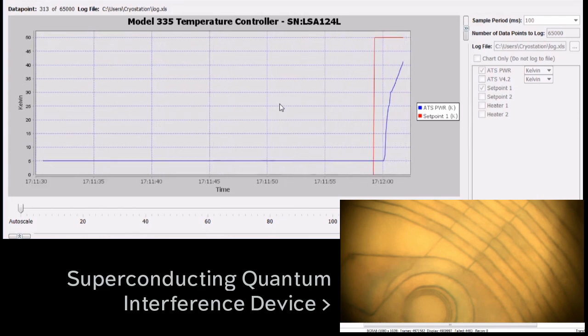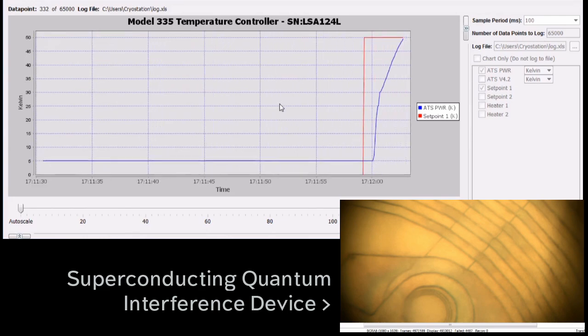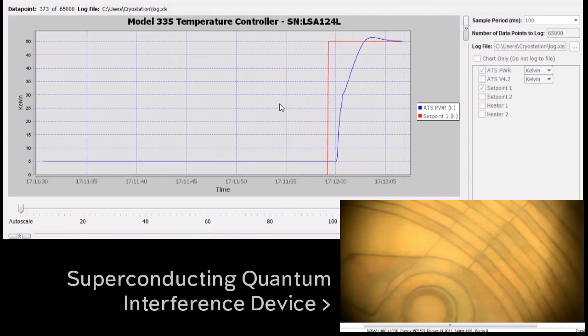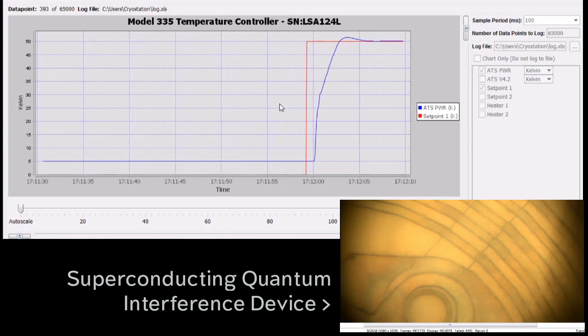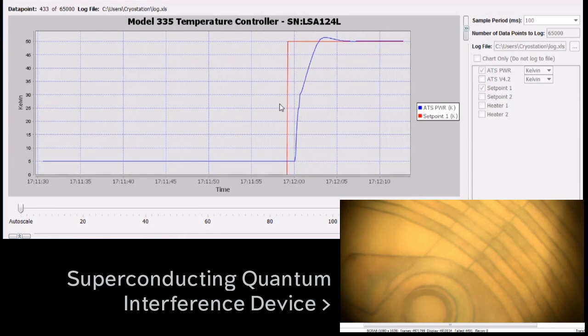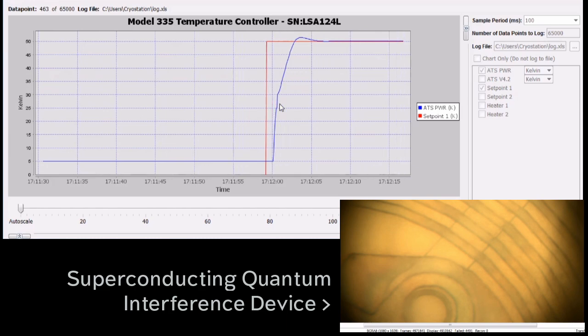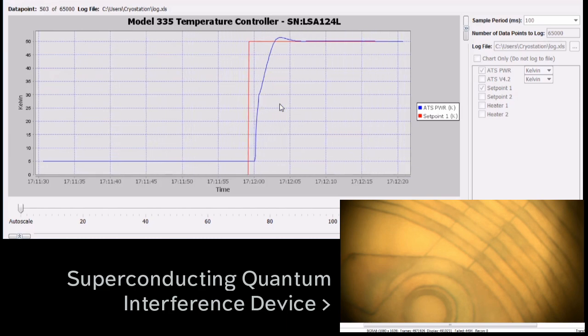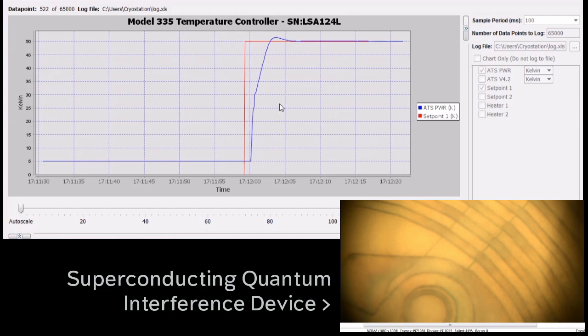What you'll see is the red line illustrates the set point and the blue line is the CERNOX measurement which follows the red line very carefully. You can see already within about 10 seconds we've reached a stability of 50 milliKelvin without affecting the positional stability at all of the SQUID. At least it's not discernible by eye and focal planes stay more or less constant.